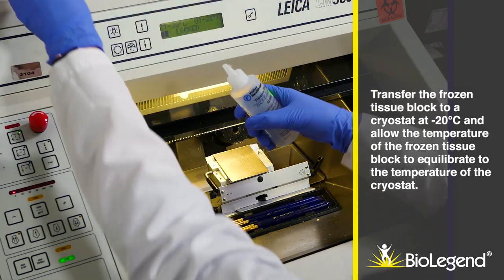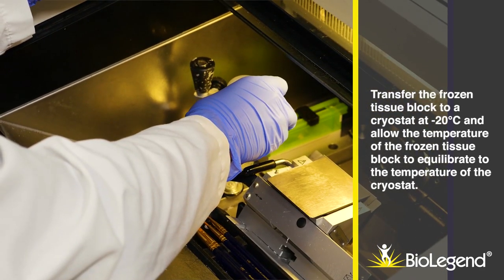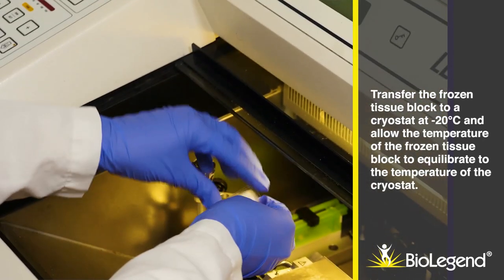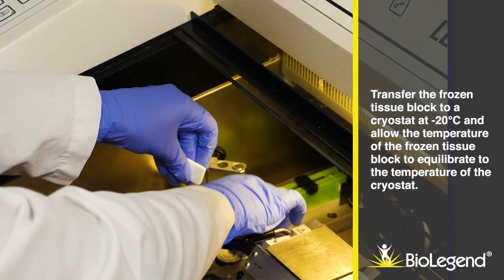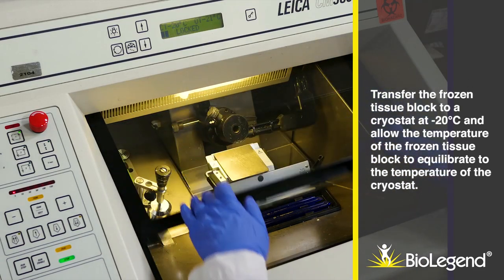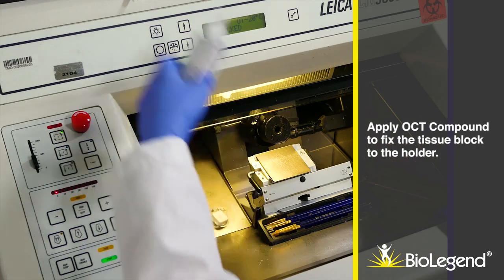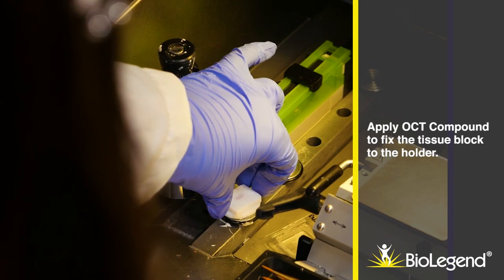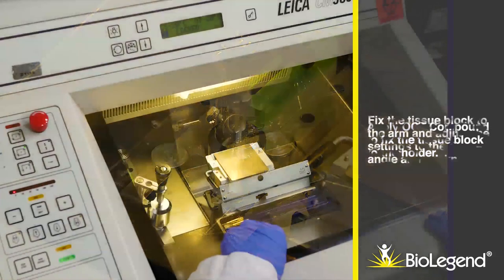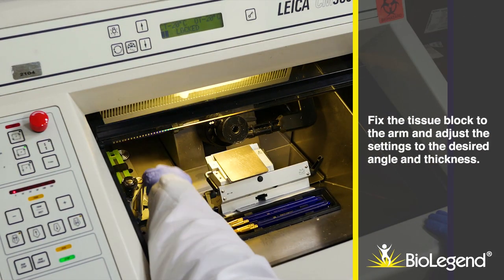Transfer the frozen tissue block to a cryostat at minus 20 degrees Celsius, and allow the temperature of the frozen tissue block to equilibrate to the temperature of the cryostat. Apply OCT compound to fix the tissue block to the holder. Fix the tissue block to the arm and adjust the settings to the desired angle and thickness.